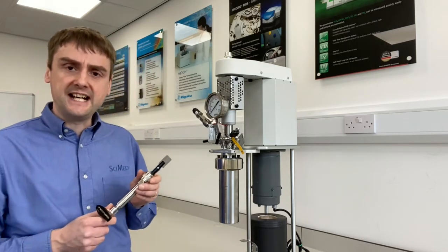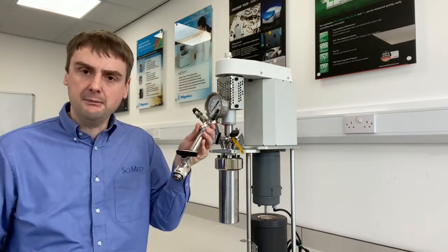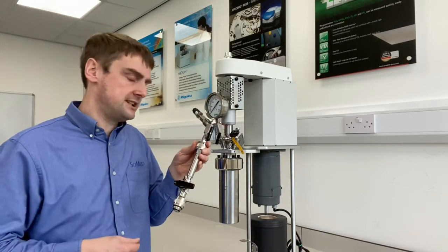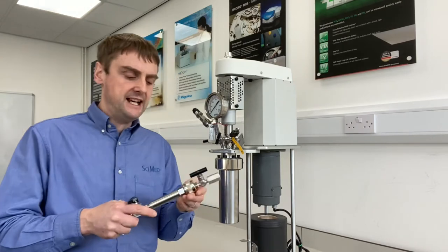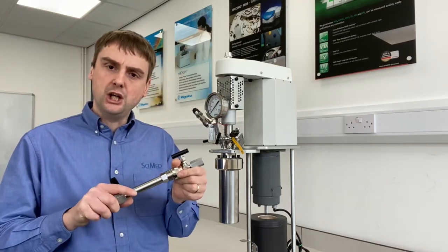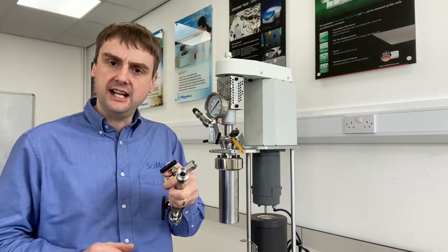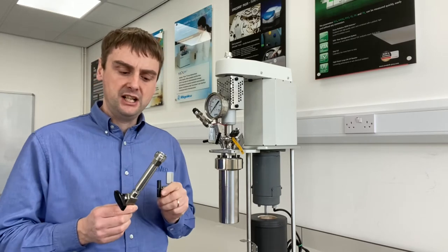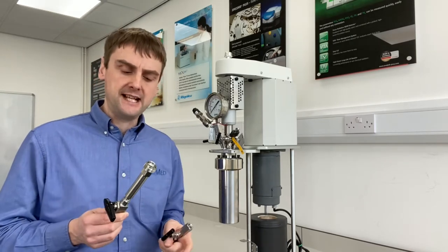The XCAD can be removed from the vessel by a simple hand fitting device. It can then be taken into a glove box, and by a hand operation method you simply open it up. You can then add your catalyst into the device. The chamber can be either 5ml or 10ml in volume — this happens to be a 10ml one.